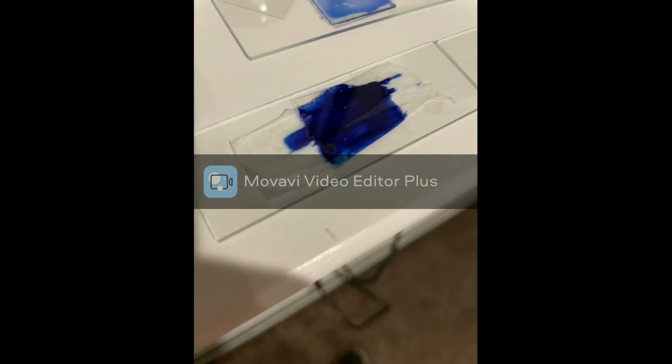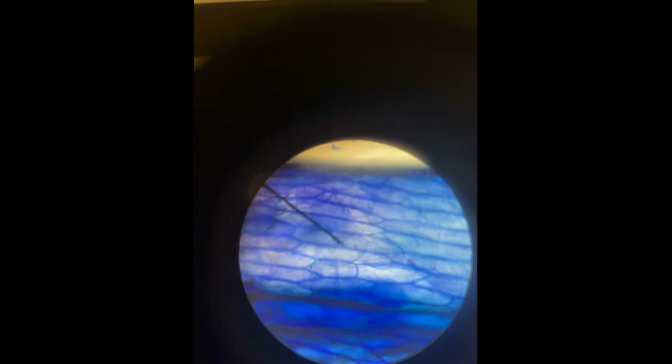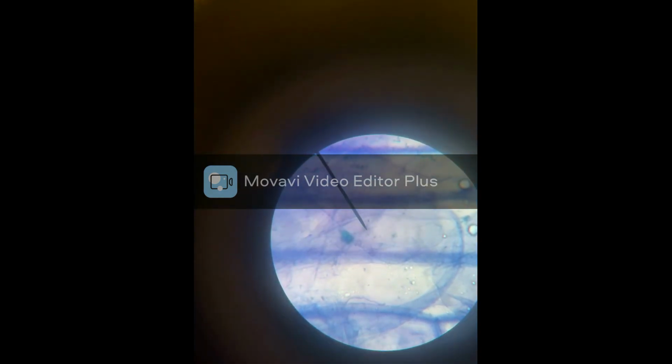Take a look at some plant cells, some onion cells, nice and thin so we can take a look, and again we're going to dye it blue so we can maybe see some of those organelles showing up. If we don't dye it blue, it doesn't really show up as well, and you'll see that in the next example. And so all the way zoomed in, we can see that little blue mass. Wonder what that is.